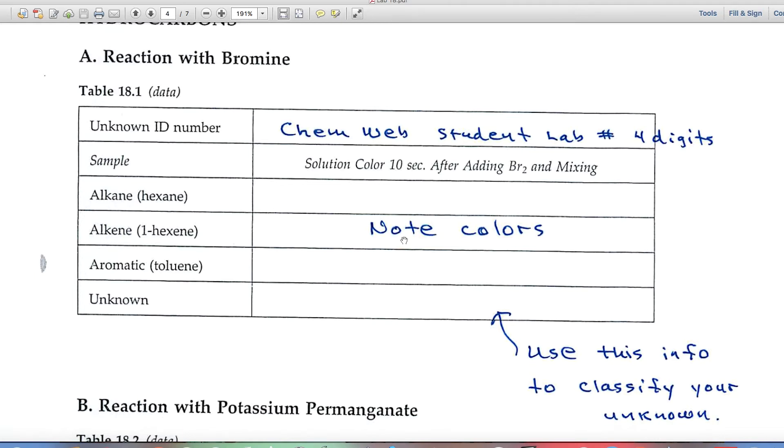In most cases, the red color of the bromine will disappear, and you'll get a different color. And then you'll also test your unknown, and you'll use this information to classify your unknown.